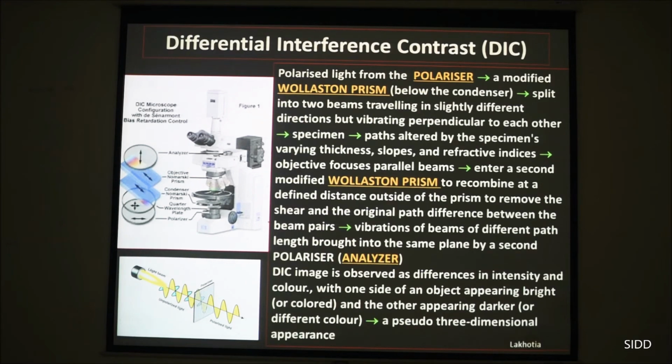A polarizer is a special device, a glass, which ensures that light rays oscillating in one particular direction only can pass through. All of the others are blocked. For example, this cartoon shows the yellow and blue are the same light but oscillating in different directions. Once they pass through the polarizer, the blue plane polarized light is obstructed and you get polarized light.